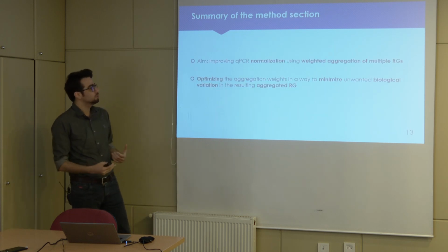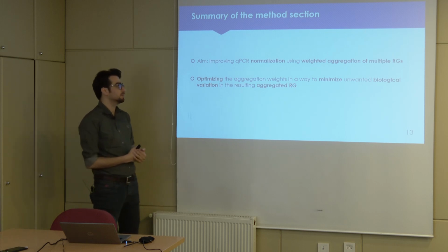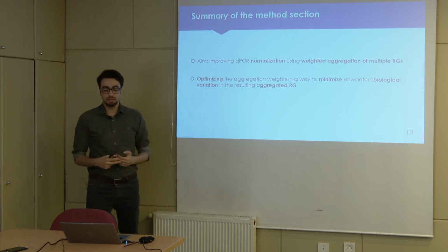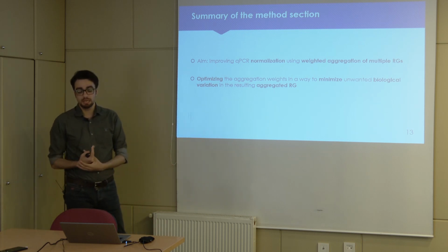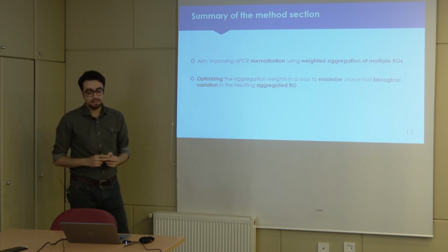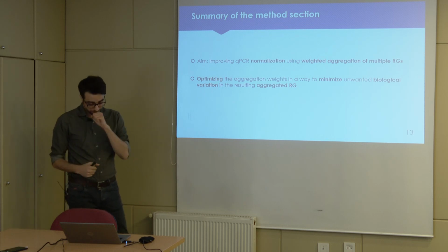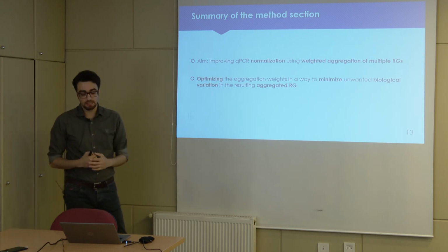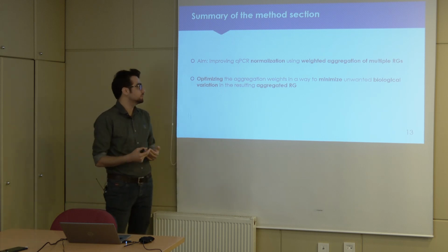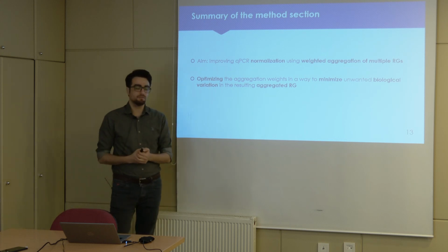If I want to give a summary of the methods I just explained, here we are improving qPCR normalization using weighted aggregation of multiple reference genes, and optimizing the aggregation weights in a way that minimizes the biological variation in the resulting aggregated reference gene.